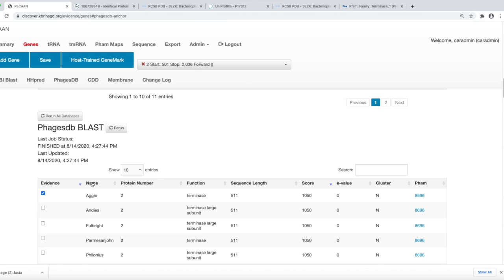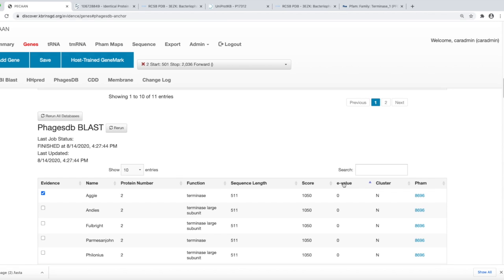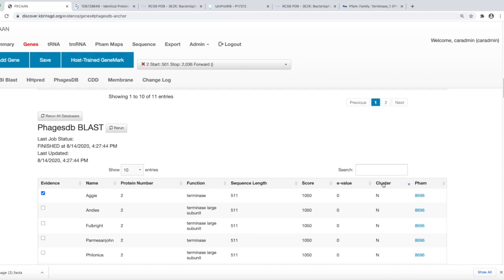There are headers at the top here. When you click on these headers, for example, it will sort the top 100 hits based on the values within that column. For example, here you see the E value, the high and the low, being sorted. Or you can even sort by cluster.